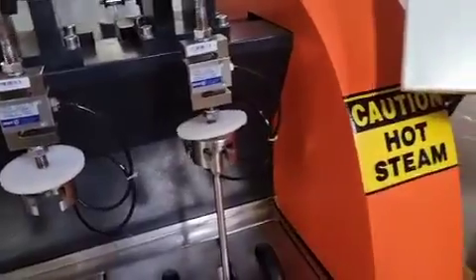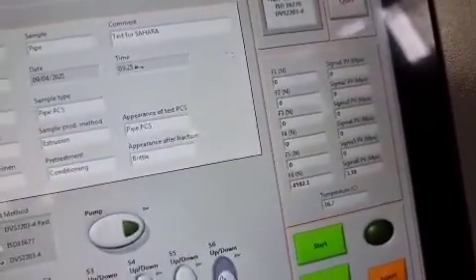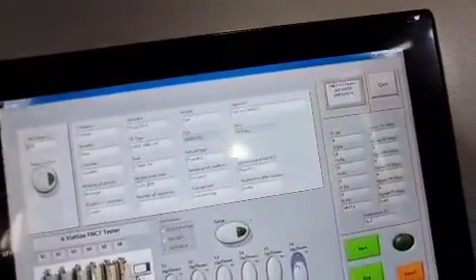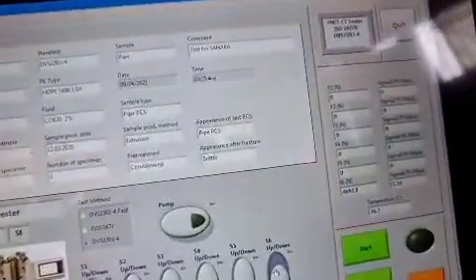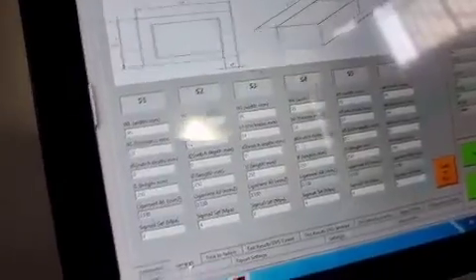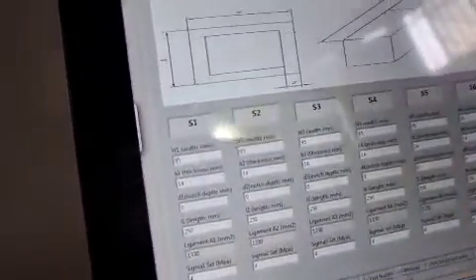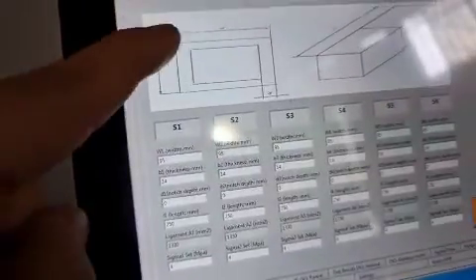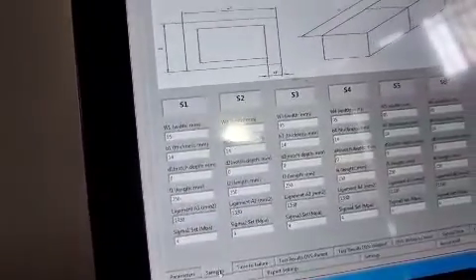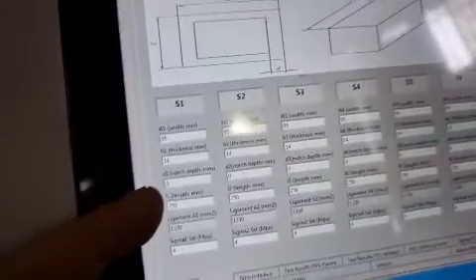After you load the sample, you will see the force and the stress in the cross section of the sample. You can see this is station number six, already loaded, and the stress in the cross section is calculated. In the samples page, you have six samples to define. If it is a notch creep test, you need to define the notch depth. If it is a plain creep test (not notched), set the notch depth to zero, and define all other parameters.